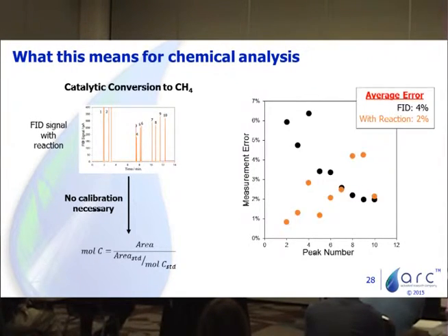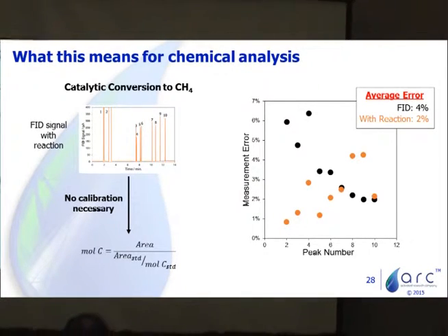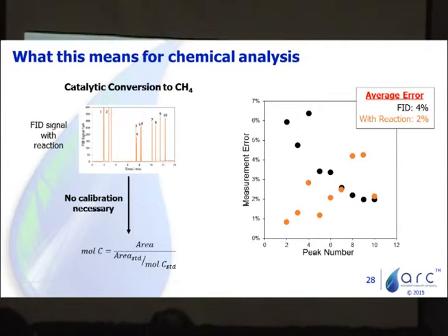And what we get in orange is similar, if not better, errors on average than using a 5-point calibration curve with the FID. And again, this was a sample that had a number of different types of functional groups and atoms, and also size of molecules.